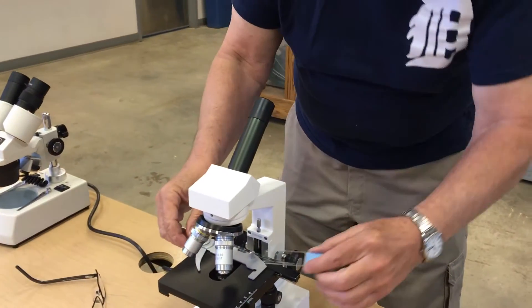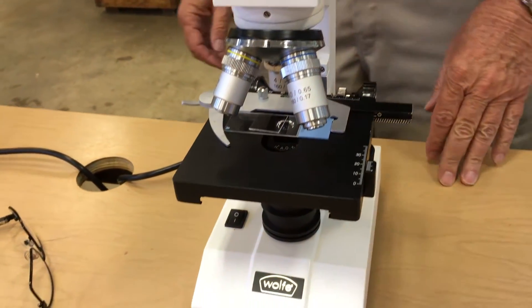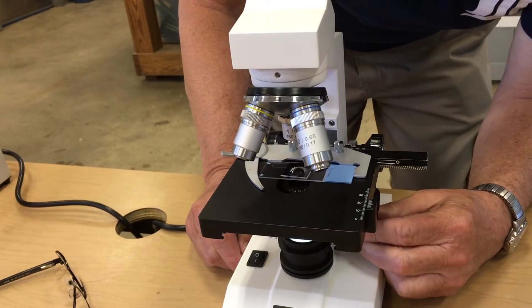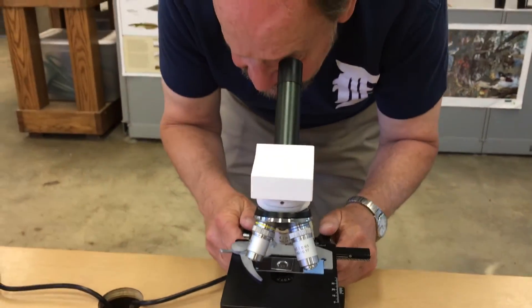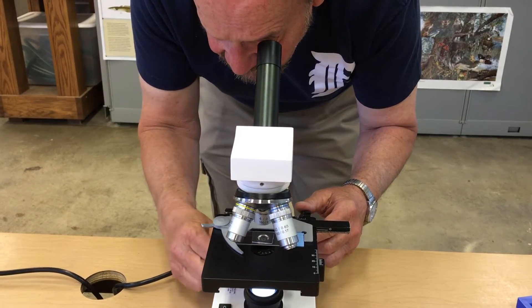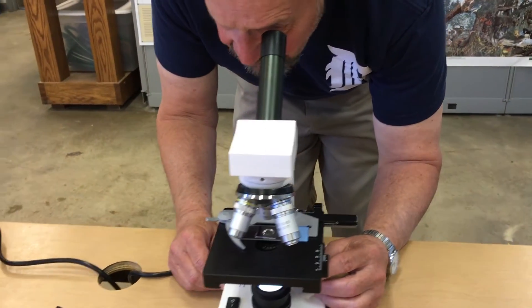I'm going to put it on the stage in the clip, then turn the light on. I'll move it right over the top of the light, and only then will I go and start to focus. It's on the lowest power and I'm going to focus in. I don't see anything, so I'm going to use the vertical and horizontal controls.